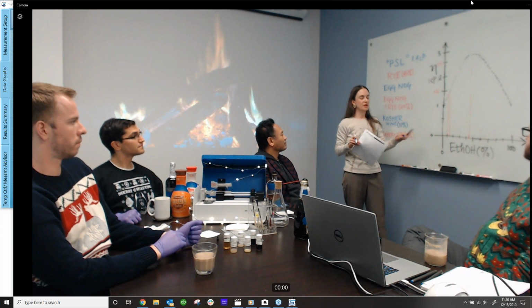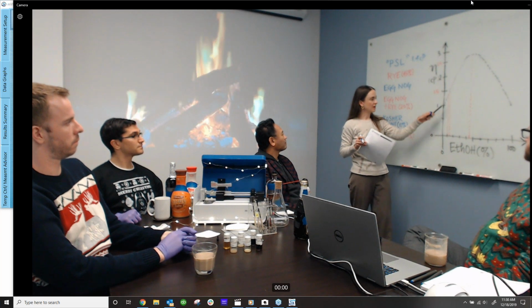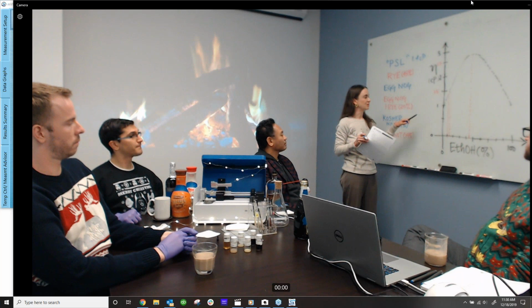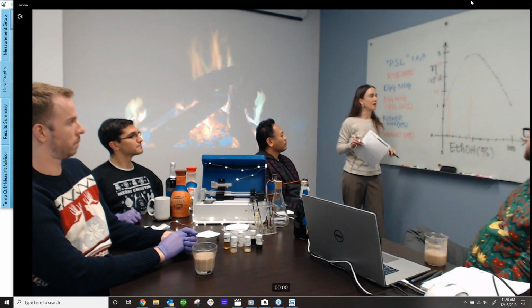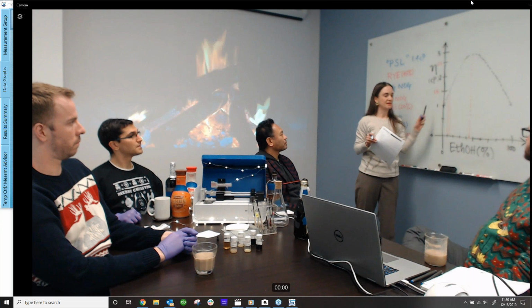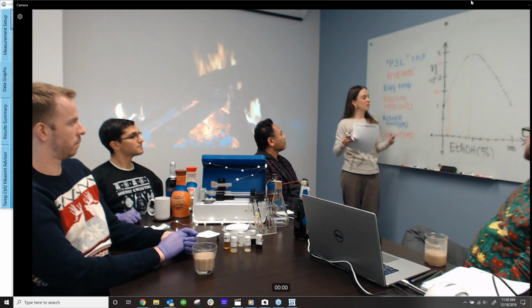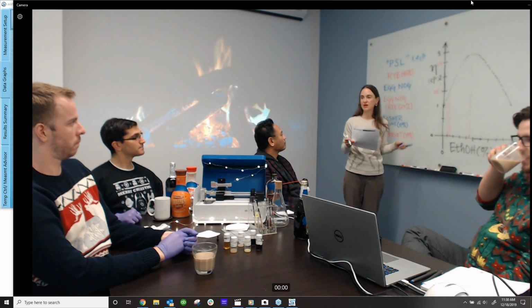Alcohol water mixtures are interesting because although the viscosity of pure water and pure ethanol are pretty close, off by maybe about 10%, when you start mixing them, you get this peak and then a drop off instead of having just a nice line connecting them. Once you start mixing them, the way the water and the ethanol interact, it's not ideal, and it gives you some interesting behavior.